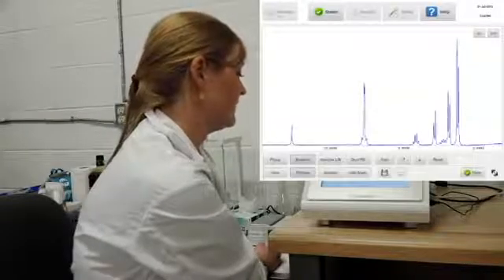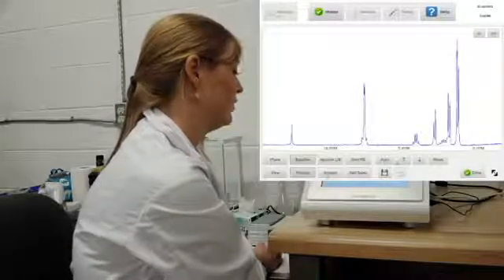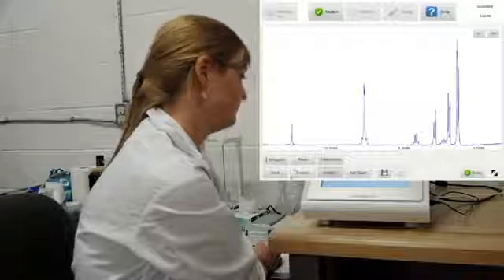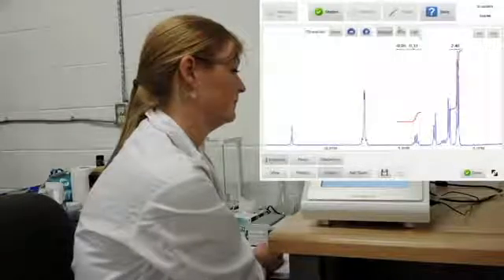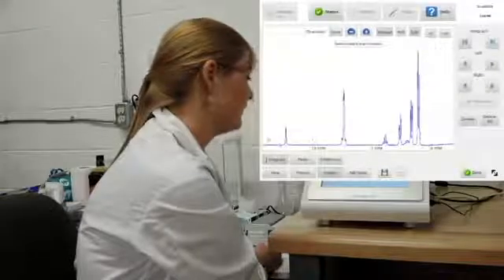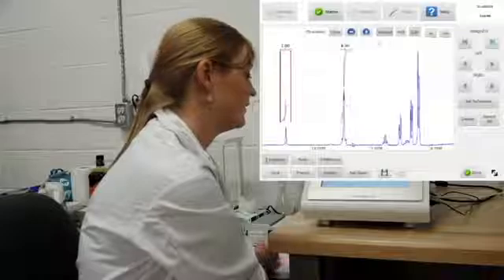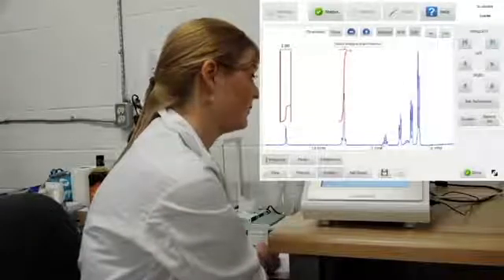Okay, so now I'm just, like I've done before, I'm going to baseline correct and go in and integrate my peaks. Okay, so I'm going to use again my mouse just to give me the rough integration here that I can then tidy up using a little bit more fine control with the buttons.